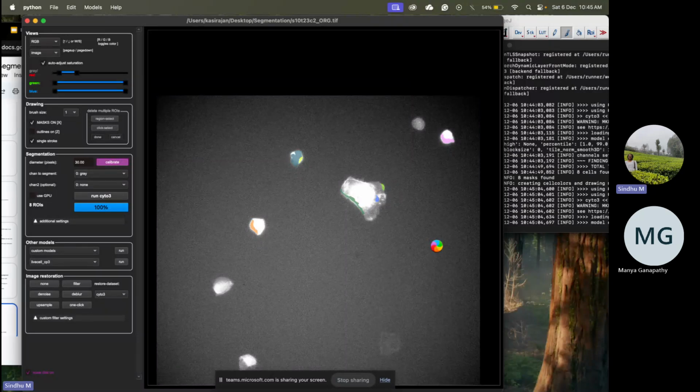I was saying that Cellpose is mainly written for Windows. So things like running Cellpose on GPU and training a new model are better on Windows than on Mac. Essentially, they first wrote it on Windows and then it was adapted to Mac, so some features available on Cellpose for Windows are not available on Mac.